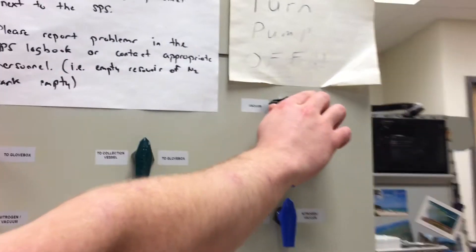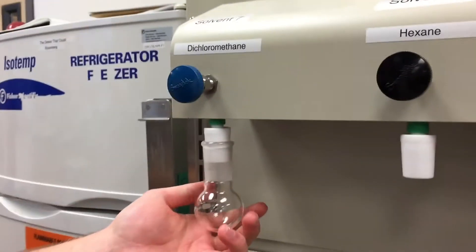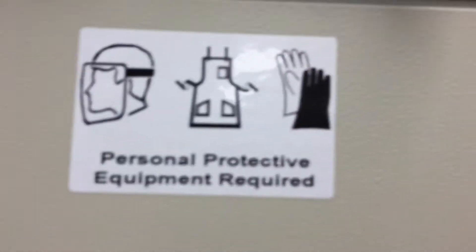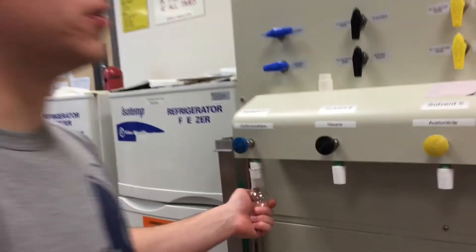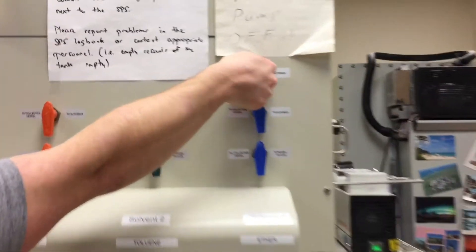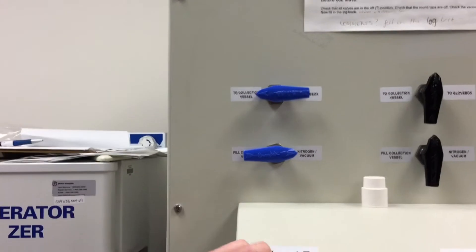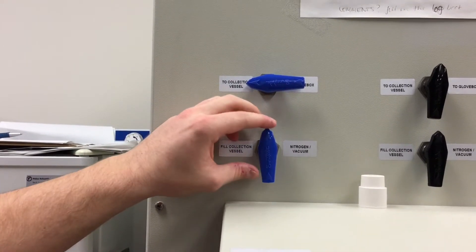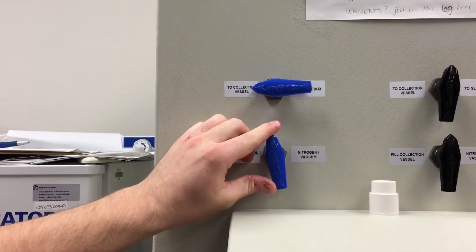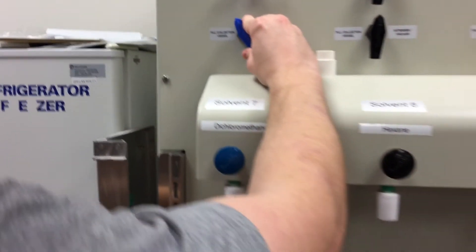Then we will do it one more time and then we will get to the good stuff. Now we are going to move to the next step. First we are going to purge the system with nitrogen again, then we are going to turn this black knob to closed. Then we are going to come over here and turn this blue knob to closed, then turn it to fill vessel — but turn it slowly because it comes shooting out.